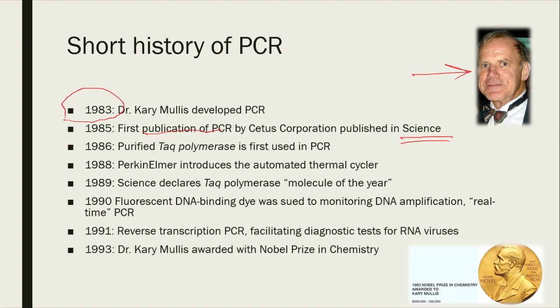Anyway, further down there are applications using Taq polymerase in PCR reactions, and along the line there is the invention of the automated thermocycler. So before 1988, for about 5 years, people were doing very old school reactions. We're going to talk about it a little bit. I've never seen it.